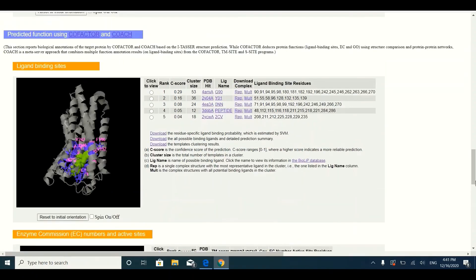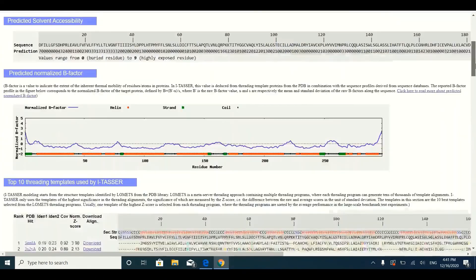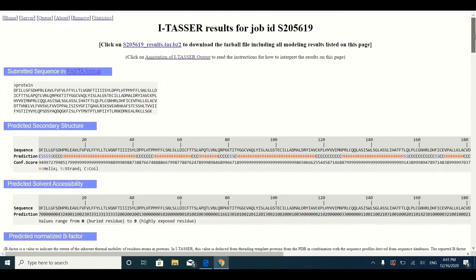This was a brief introduction to the I-TASSER results you will receive after submission of your job. We hope this information will be useful for making predictions and analyzing I-TASSER results for your protein sequence. Stay tuned with us for more informative tutorials — thank you so much.